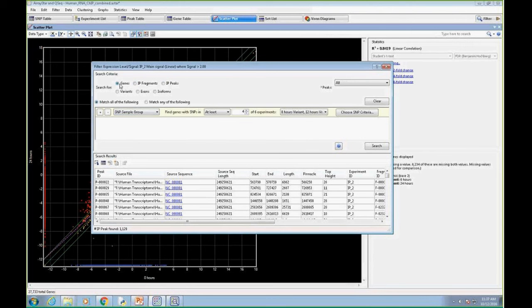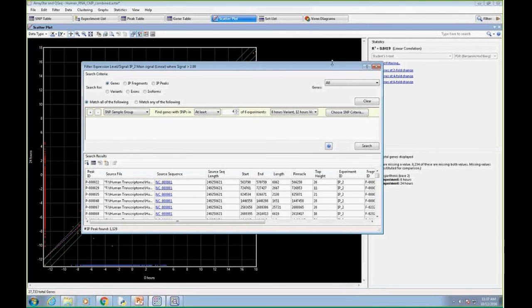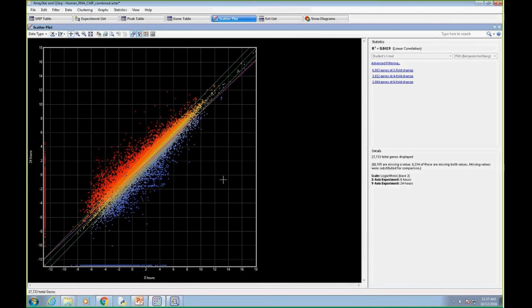And we can see if I stay at genes, I have all different filtering criteria. We've got multiple webinars where we dive into how to use the full capability of the filters in ArrayStar. But there are also quicker ways, and we create hyperlinks and ways to find what we want without having to dive so deeply into the filtering.